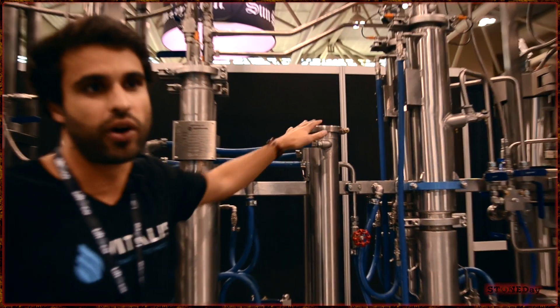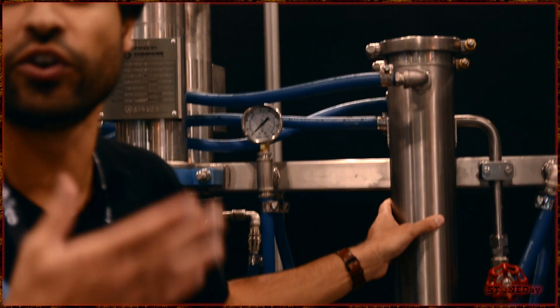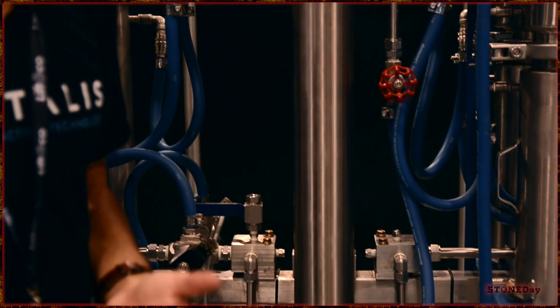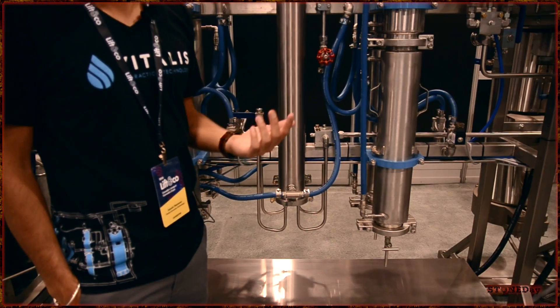And this is the heat exchanger. This is the part where you set your temperature, or not at all, depending on whether you're doing a subcritical or supercritical run. You have higher temperatures for THC, CBD, and things like this. Meanwhile, you have lower temperatures for terpenes.